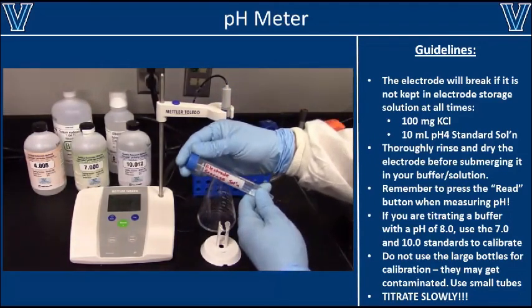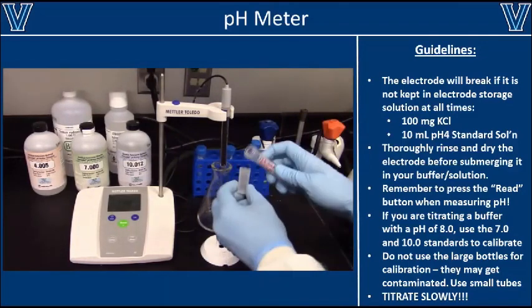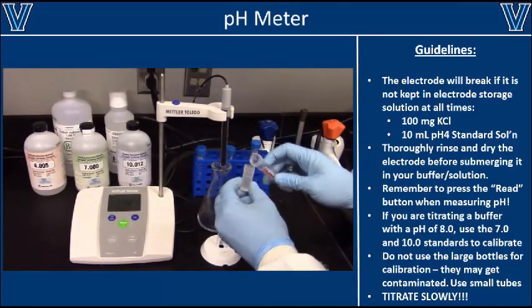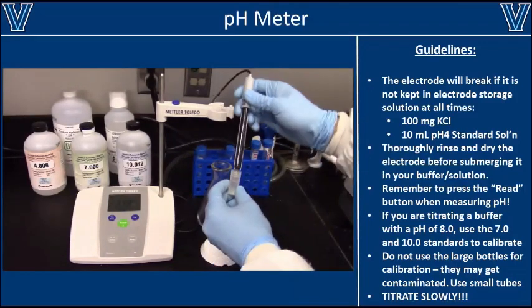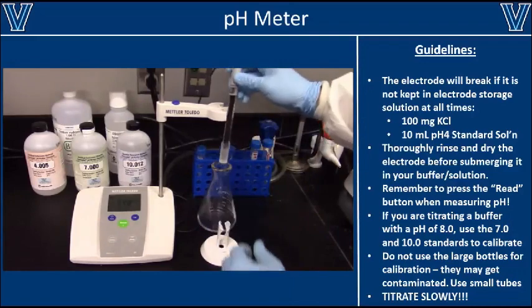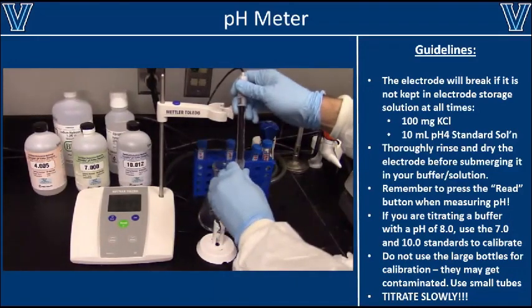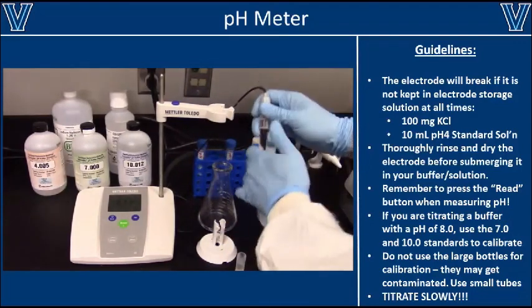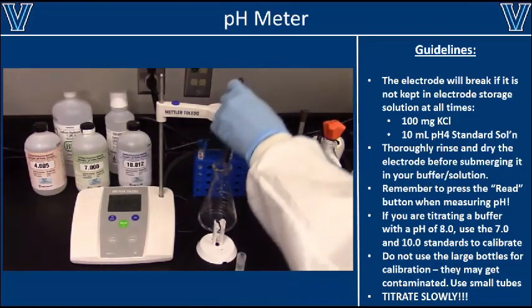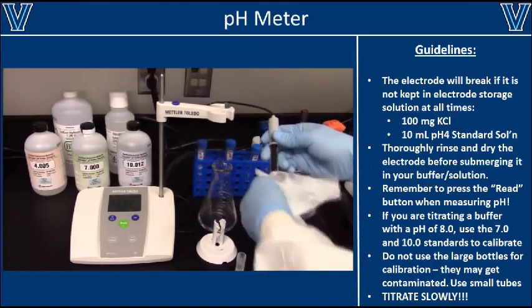Several companies offer pre-made storage solutions, or you can make your own by mixing 100 milligrams of potassium chloride with 10 mLs of the pH 4 standard solution. When you are ready to use the electrode, remove it from the storage solution and thoroughly dry it with a chem wipe. Next, rinse off the electrode with Milli-Q water and dry it again.